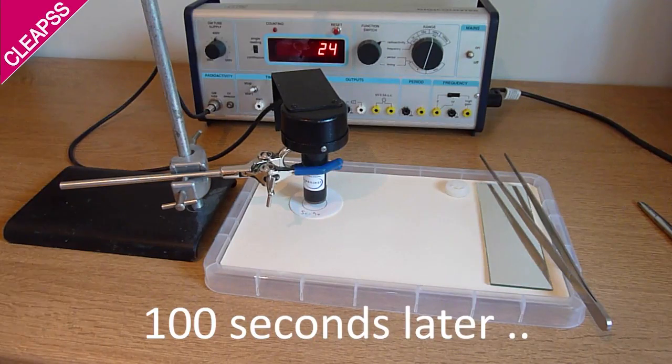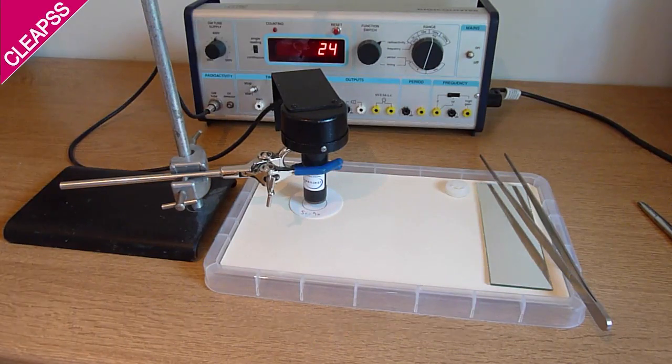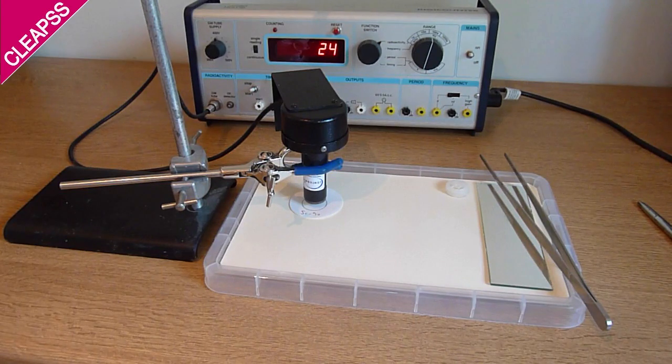If the total count from the filter paper and background, which in this case is 24, is less than twice the average background over 100 seconds, the source has passed the leak test. So for example, the average background count here over 100 seconds was 29.6. The count from the paper and background was 24, so the source has passed its leak test. But if the count had been over 59, it would have failed and would warrant further investigation.